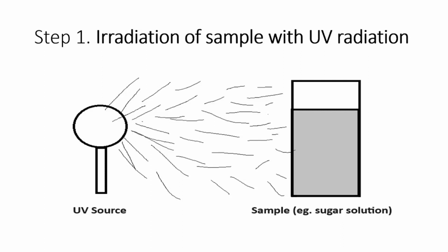The first thing you have to do is think about exposing the sample to what? The radiation. How do you do that? Most labs have the ultramodern spectrophotometer, where you can just put your sample in a cuvette and put it in a machine, and it runs the spec for you. But we want to understand what actually goes into it, what happens within the spectrophotometer. That is what we are looking at.